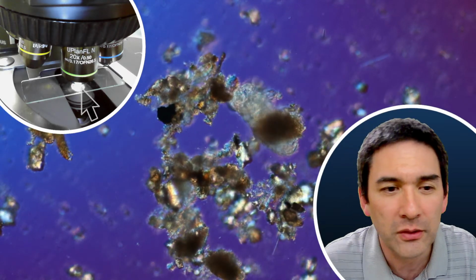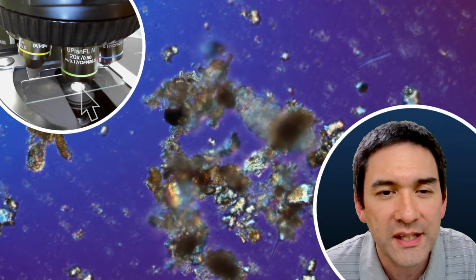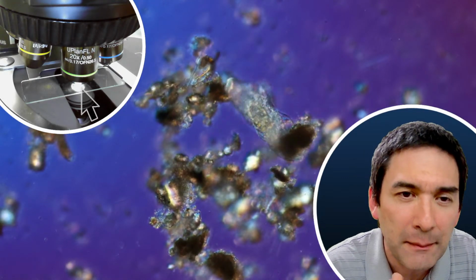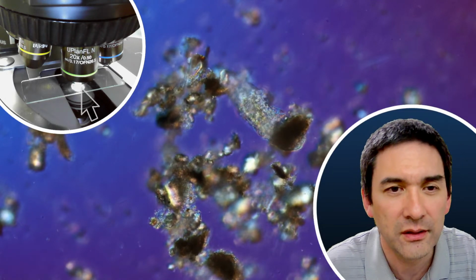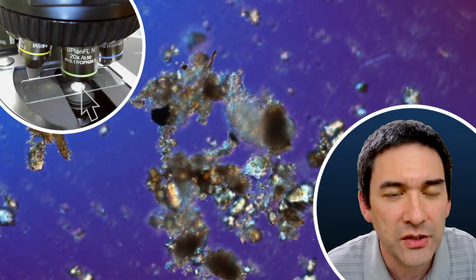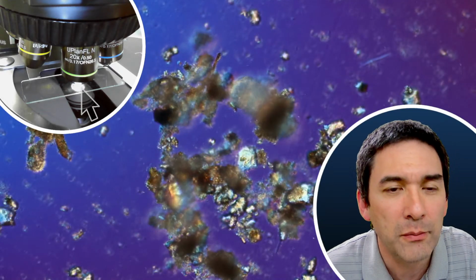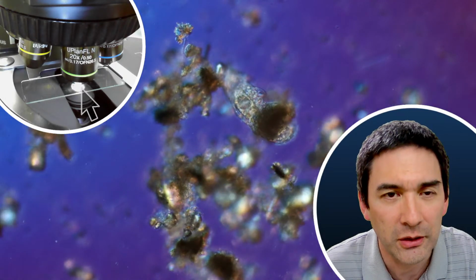For example, some of the sand grains seem to be a little bit darker on one side than on the other, so they appear to have some kind of depth to them, right? And that is what DIC actually does. It uses polarized light and all these things. The reason I decided to get DIC is simply that when you make YouTube videos and live streams, it's nicer to see a little bit of color.